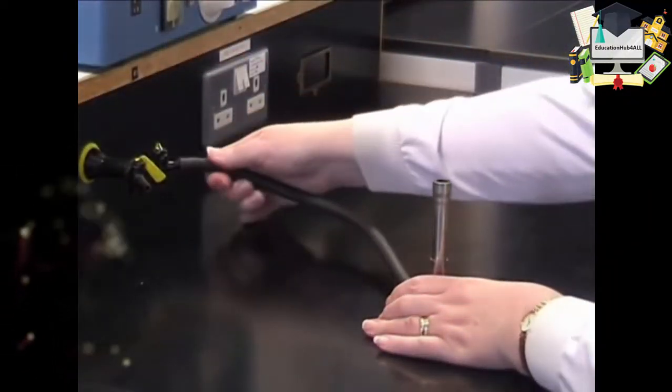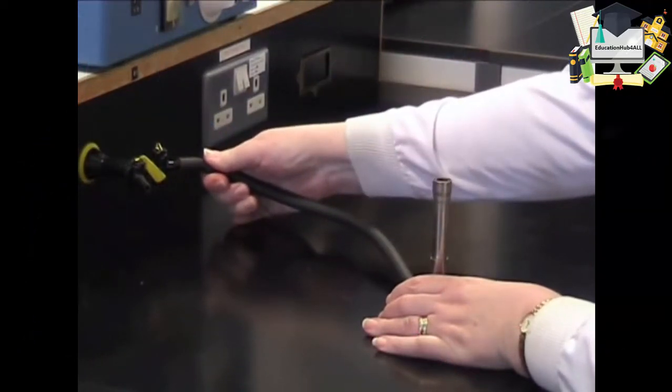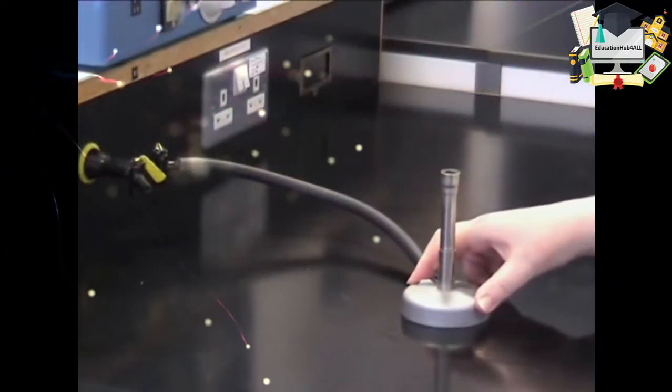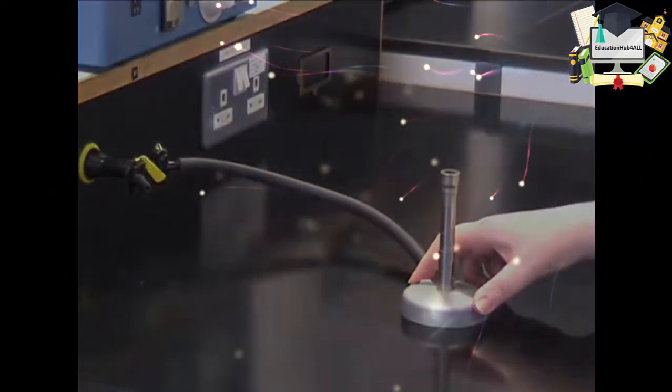Before lighting your Bunsen burner, it's important to check that the rubber tubing attached is securely connected to the gas tap. When you're using it, you can move the Bunsen burner around to make sure it's in an appropriate position for your work, but try not to move it too far and loosen the connection on the gas tap.